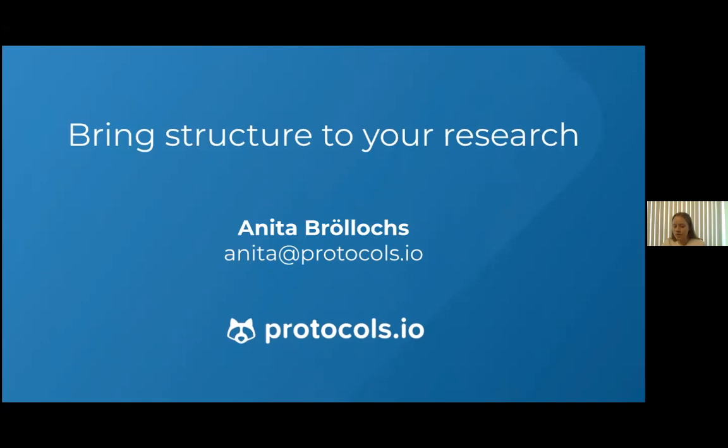One question says, can you group protocols that belong together? That's a great question. And I think what they mean is, of course you can have groups where you can have all the protocols that belong in that group, but oftentimes you have a workflow that might have individual protocols that go along together because you might have different things you need to do for one sample.